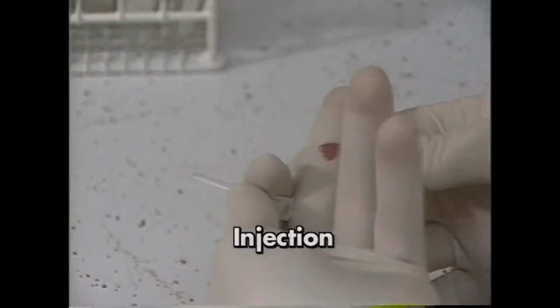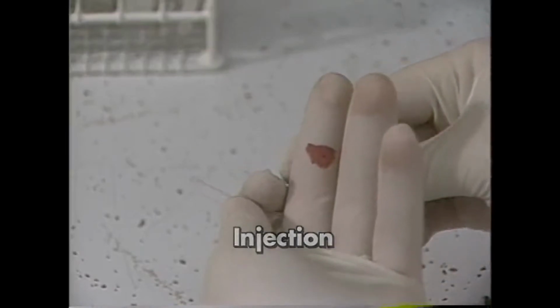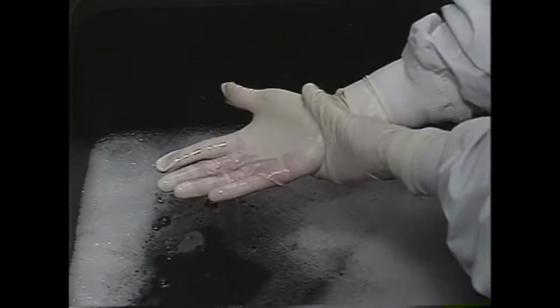Injection is another route of entry to be aware of. Needles aren't the only source of this kind of exposure. Broken glassware or sharp instruments can also cause trouble. Report any exposure to a hazardous chemical to your supervisor. Then seek professional medical attention as quickly as possible. No matter how minor the exposure may seem, remember, even small doses of some chemicals can have serious health effects.